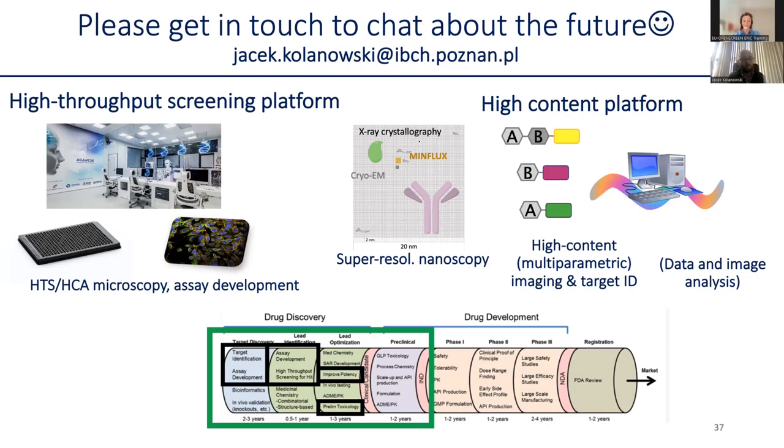Great, thanks, Jacek. Another question about bioluminescence imaging. Bioluminescence imaging has found limited use in the imaging of plant metabolites, proteins, and physiology. Can you please comment on this?